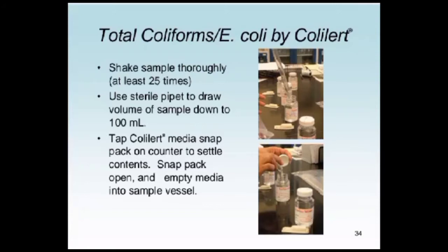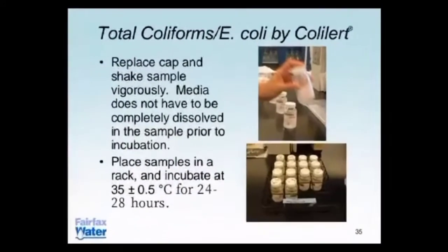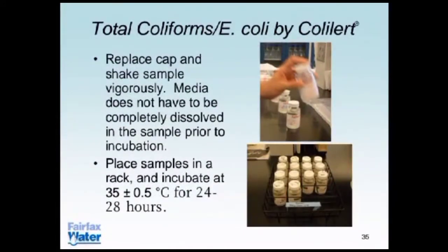Third, tap the Colilert media snap pack on the counter to settle the contents. Snap the pack open and empty the media into the sample vessel. Then replace the cap and shake the sample vigorously. The media does not have to be completely dissolved in the sample prior to incubation. Place the sample in the rack and incubate for at least 24 to 28 hours.